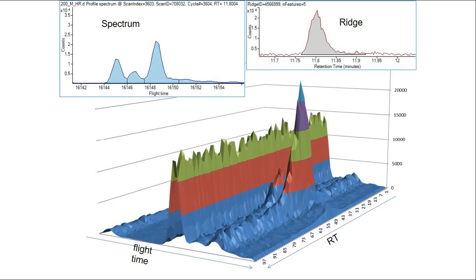It's important to understand that difference because, for example, when you're doing SureMass, you don't have the choice of parameter integrators, because the algorithmic treatment of SureMass finding the features uses the internal parameterless integrator. So there are differences that you'll see in manual integration, for example, with SureMass versus the extracted ion approach.